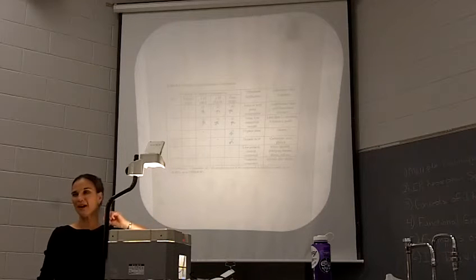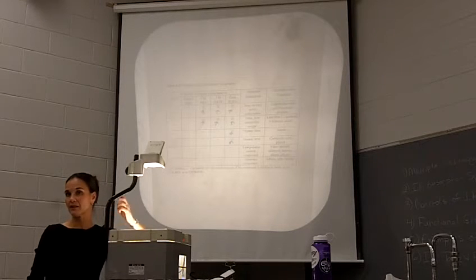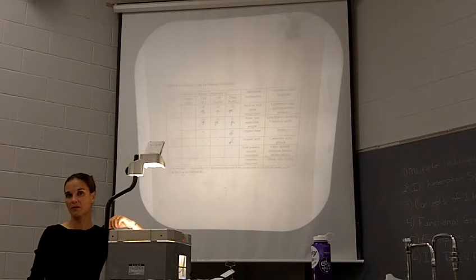You're going to use about 1 milliliter of the solvent. You don't need a lot to be able to test solubility. And then a couple drops, or if you have a solid unknown, a little bit of the solid, to test if it is soluble or not. So you're looking for, does it go into the solvent? Is it completely dissolved? Or is it floating around in the solvent, not completely dissolved, okay?